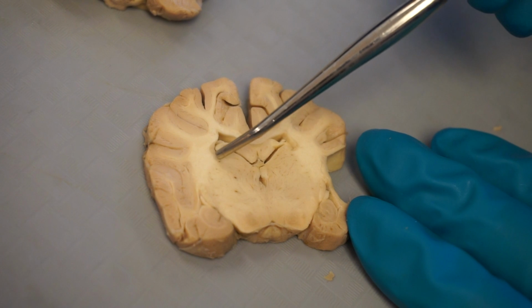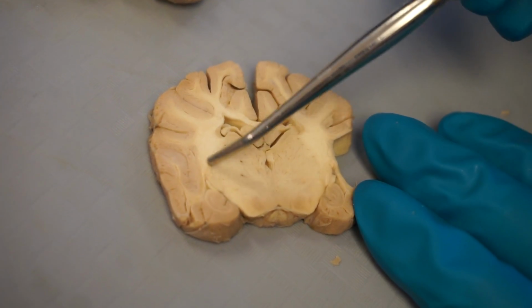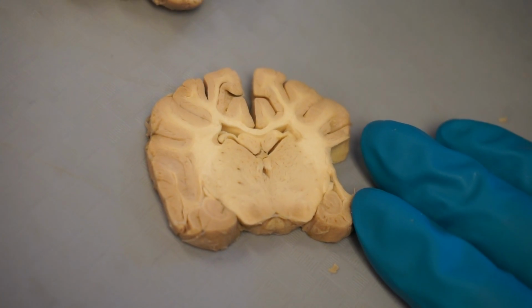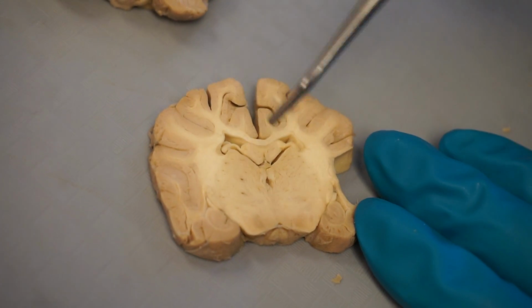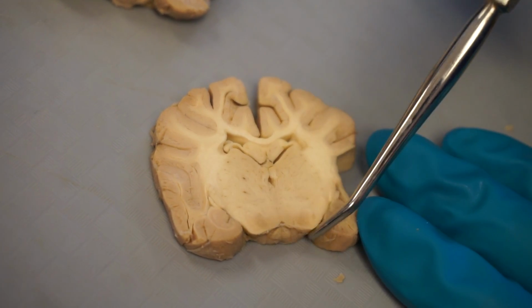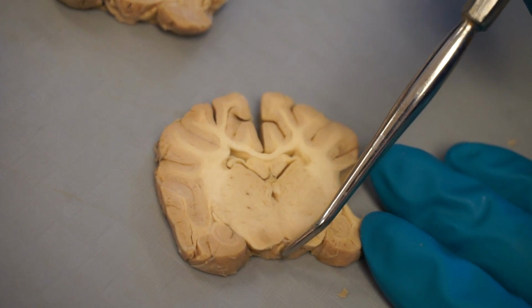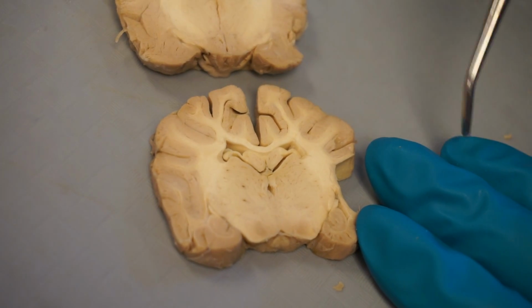The mass of tissue located approximately here and here would be our lateral and medial geniculate bodies, so conscious vision, conscious hearing. Then we get into our crus cerebri, again the continuation of our internal capsule from our previous section.